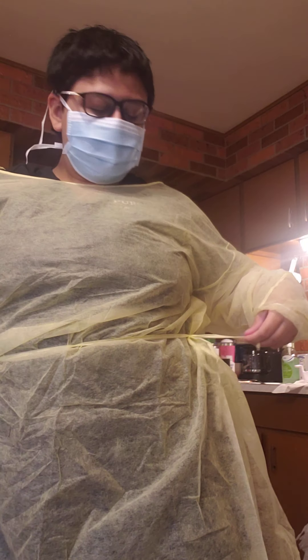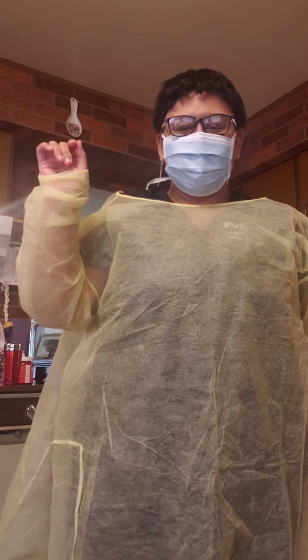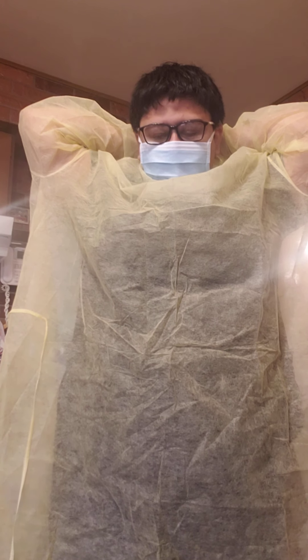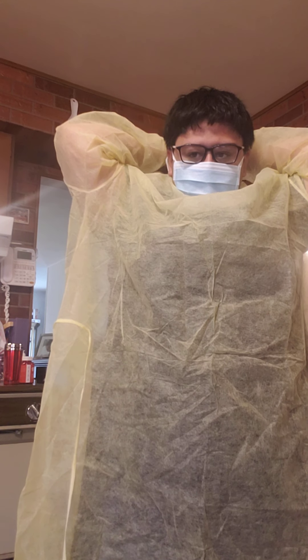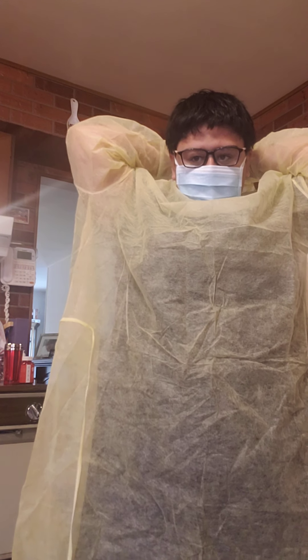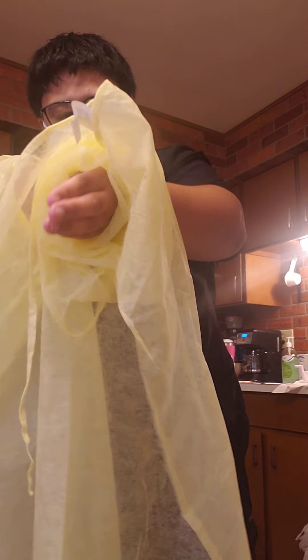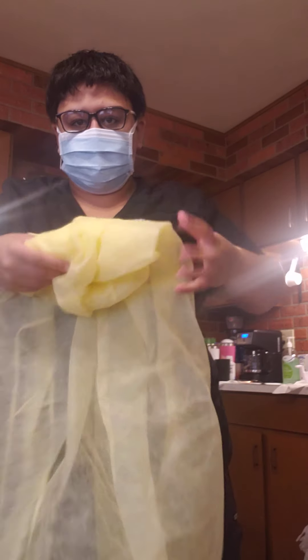Next — I should have untied this with my gloves on, but I didn't. And then I'm going to untie this part, fold that in, keep all the contaminants in, and discard that.